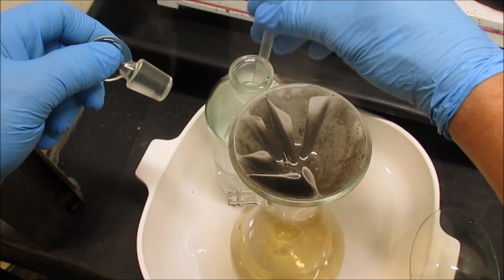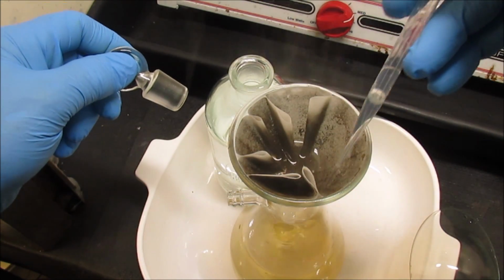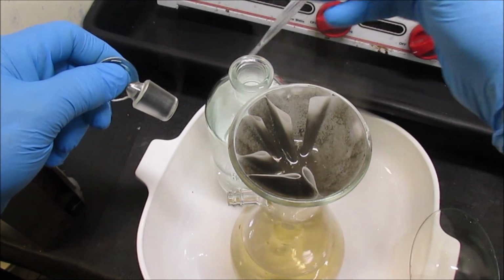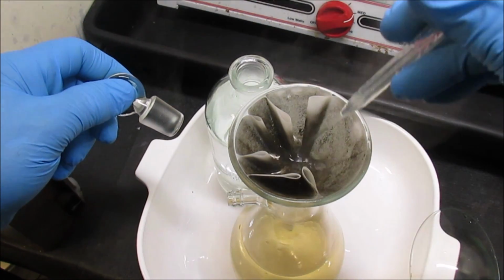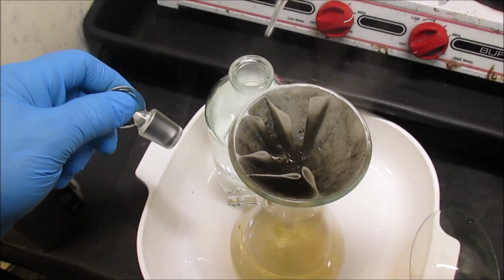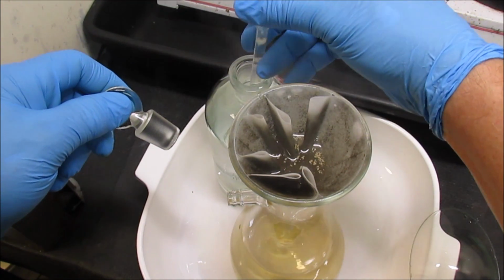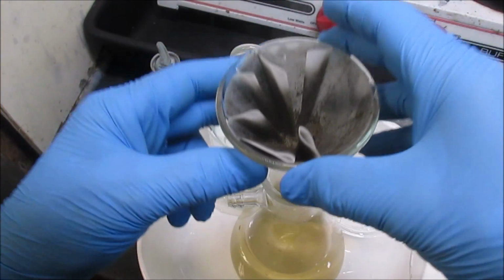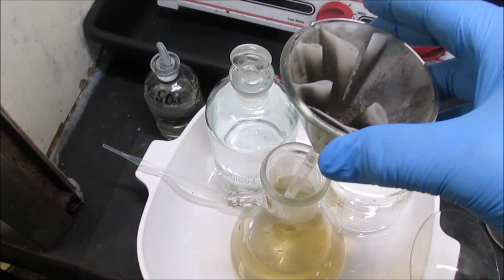I thought I seen some black stuff sticking to the bottom of the beaker. Last time I dissolved it, I just let it go. I should have rinsed it out of there. Something caused a problem here. Alright, let's get this in the beaker.